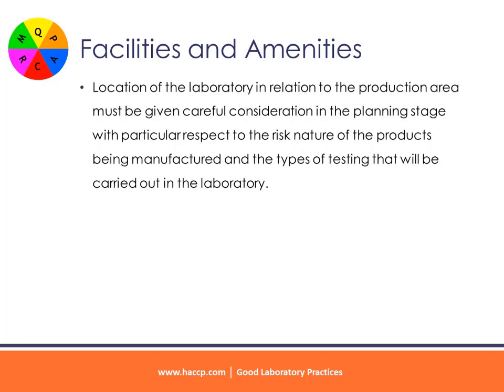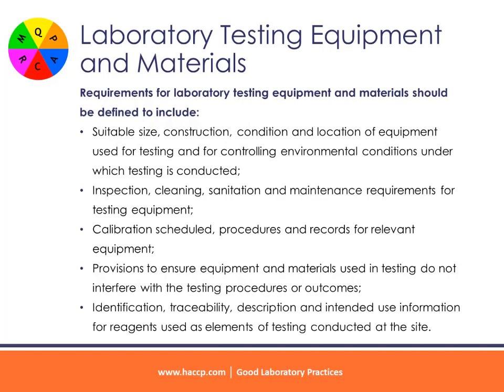Location of the laboratory in relation to the production area must be given careful consideration in the planning stage with particular respect to the risk nature of the products being manufactured and the types of testing that will be carried out in the laboratory. Laboratory testing equipment and materials.